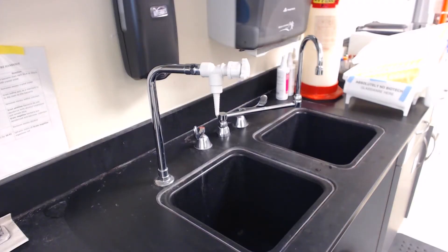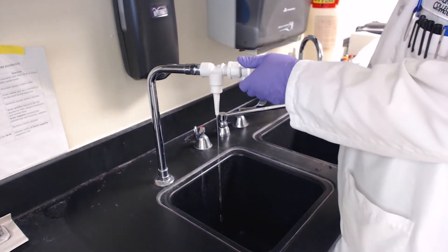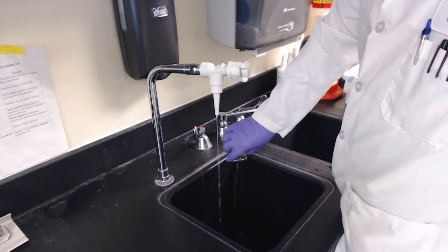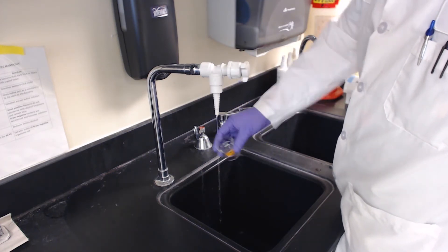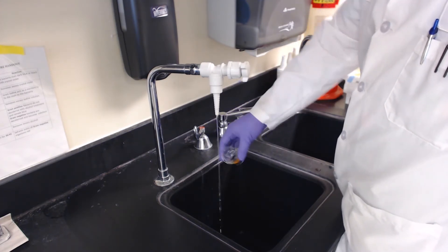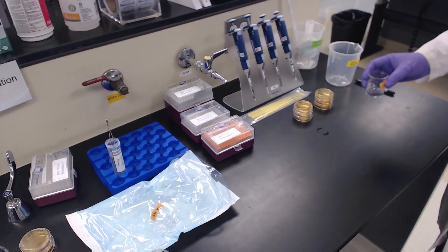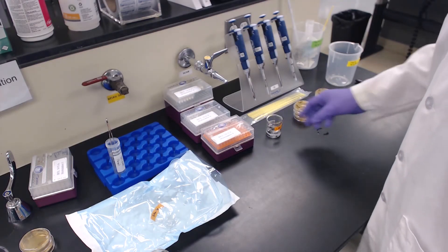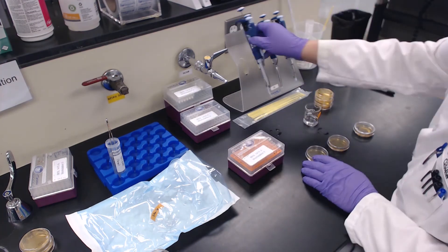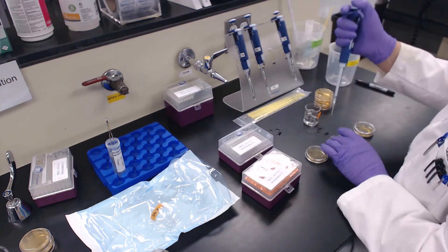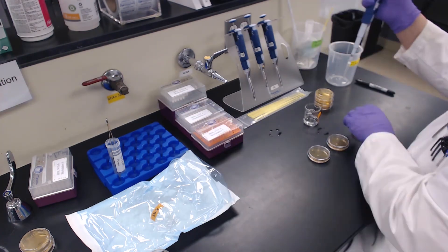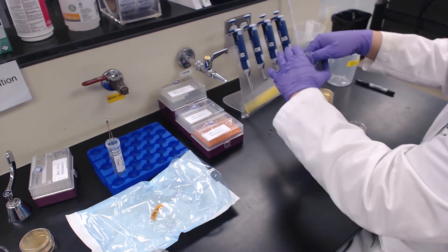Second beaker: As before, ensure your collection beaker is rinsed three times with the water source before collecting the final amount required. Again, transfer and spread 10, 50 and 100 microliters of the sample to the corresponding plates.